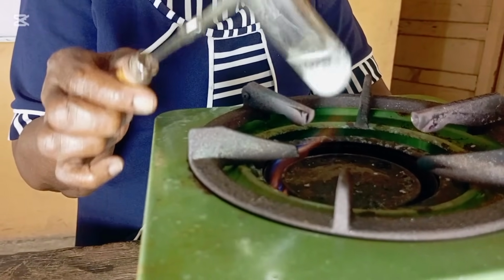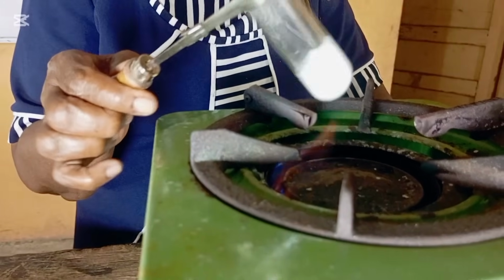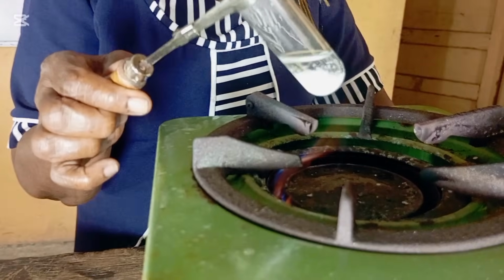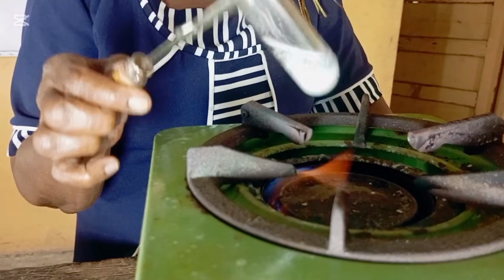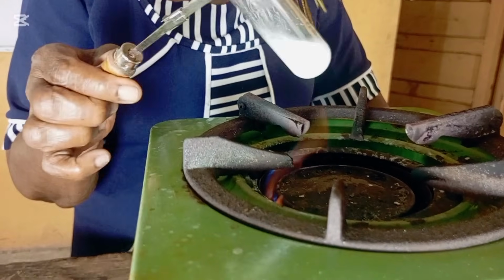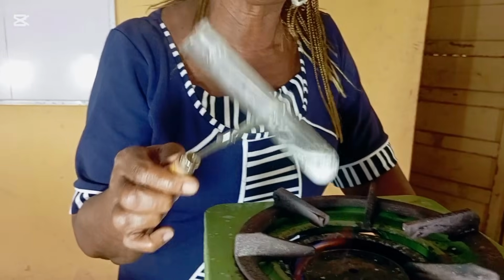And when you allow it to cool, it will reappear. What am I trying to say? Since we are suspecting lead here, which is lead 2 ion, the HCl added, a chemical reaction must have taken place. So this white PPT is no other PPT but lead 2 chloride.